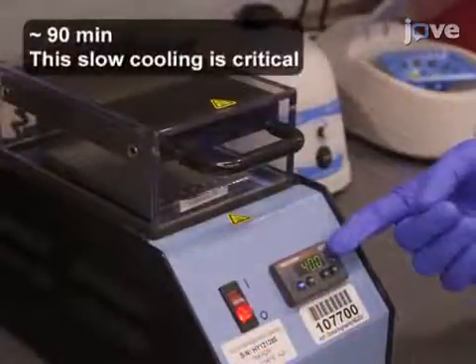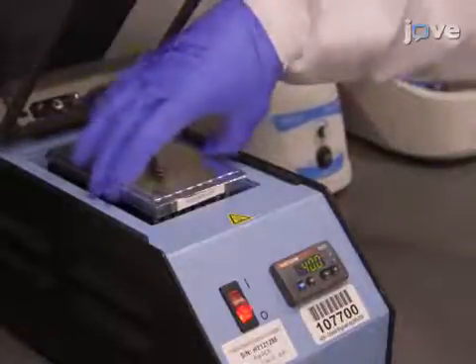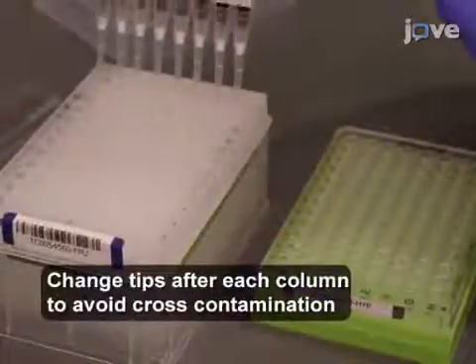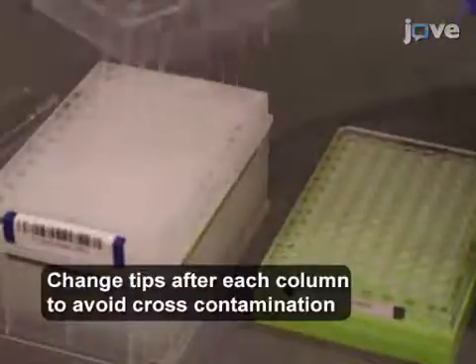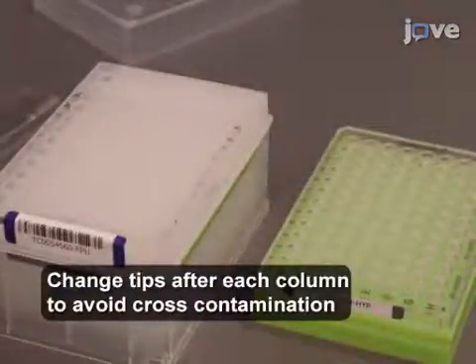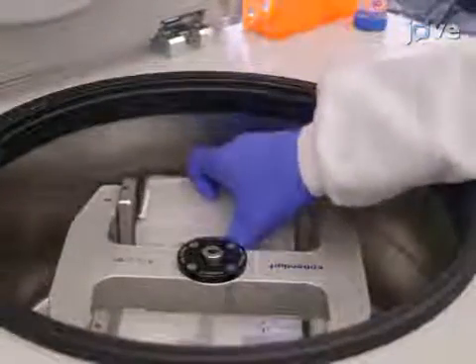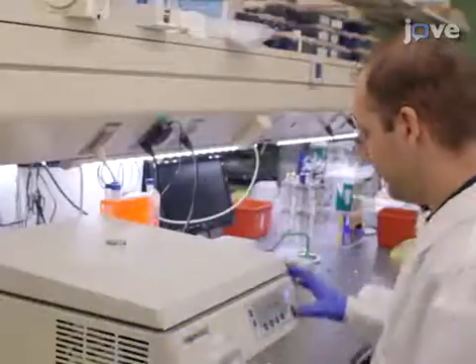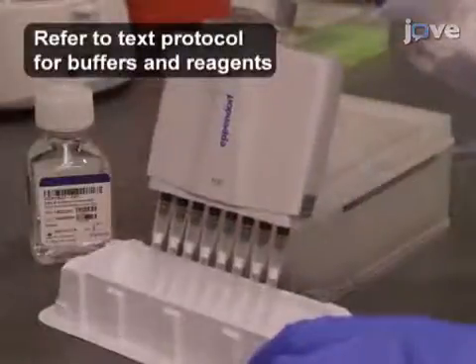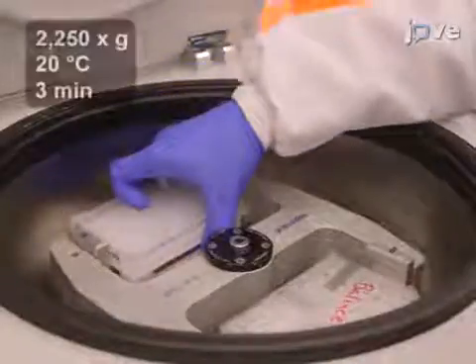After slowly cooling the incubator to 40 degrees Celsius, remove the plate from the incubator and transfer the entire volume of each sample from the HYBE plate to the center of the previously prepared corresponding pre-washed filter plate unit, or FPU. Cover the FPU and centrifuge at 2,250 times G and 20 degrees Celsius for three minutes. Then add 45 microliters of SW1 and centrifuge again.